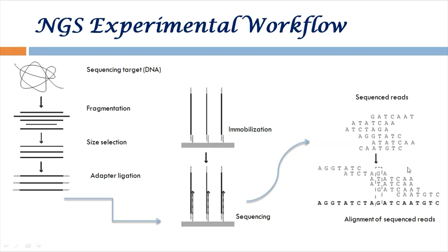Alright, but you see, we can make an average then. For every position there is a coverage, and we can make an average of coverage for all these positions. And that would be the coverage of your sequenced data. So quite often in NGS data, people say, I have achieved a coverage of 100x, I have achieved a coverage of 50x, things like that. It means that on an average, every position has so many reads representing that particular position. That's what we mean by coverage number.